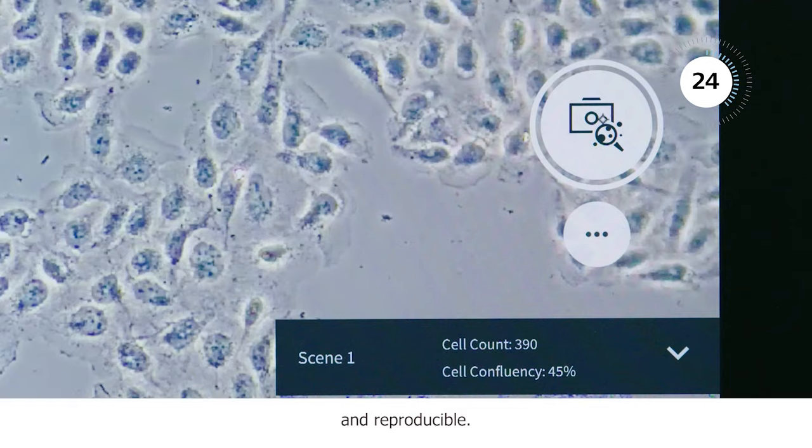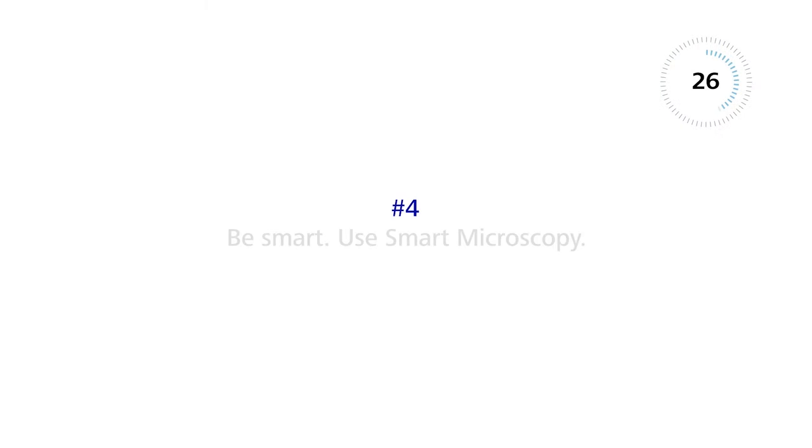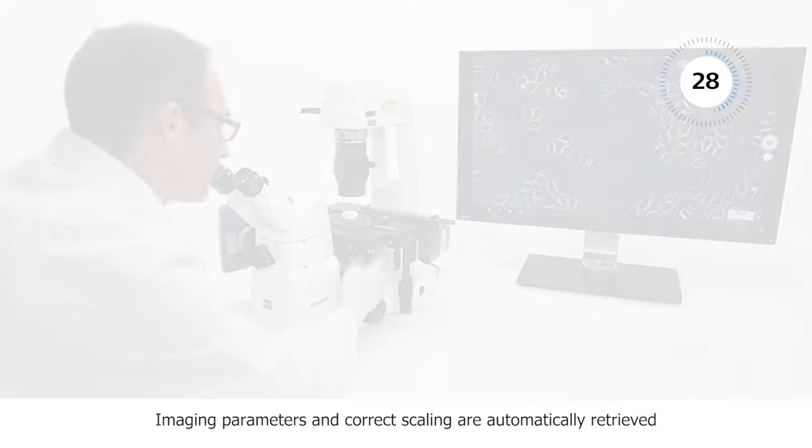Use Labscope artificial intelligence to make your data comparable and reproducible. Imaging parameters and correct scaling are automatically retrieved and saved in the metadata.